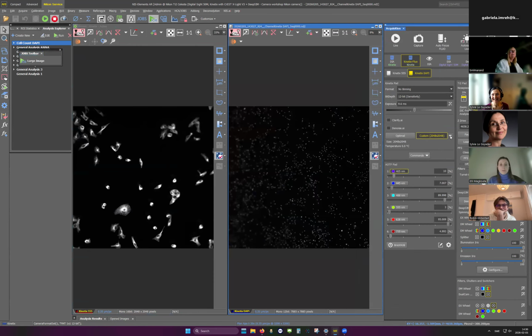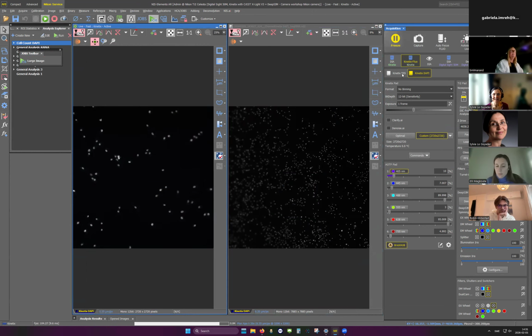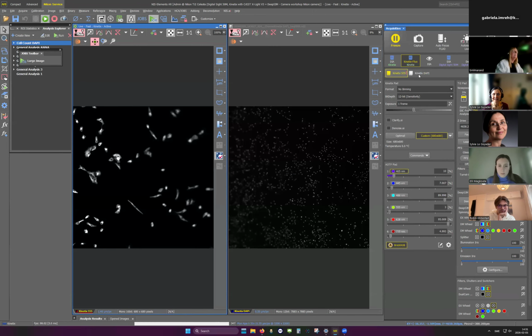So, and let's go out now to a larger field of view. And if we're looking at that, you can see, oops, it's the lookup table. I am in DAPI. We need to go to, oh, I was in DAPI, the previous one. I forgot that. I thought that I was doing.